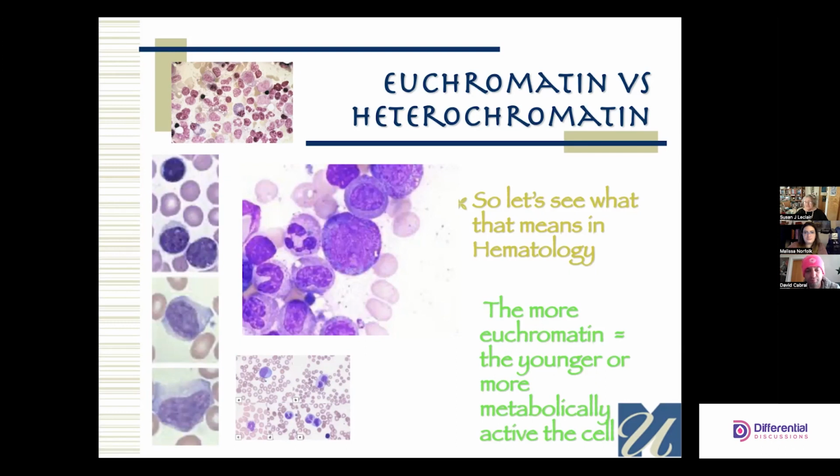It's trying to respond to the T cells that are sitting there smugly in the corner because they don't have to do the work, saying, thou shalt make an IgM antibody directed against X. And after you do that for a few days, I'm going to make you change that and make IgG antibodies against X. So this is now a cell that has to recognize directions, obey them, and put up a structure that will allow it to make some kind of antibody.